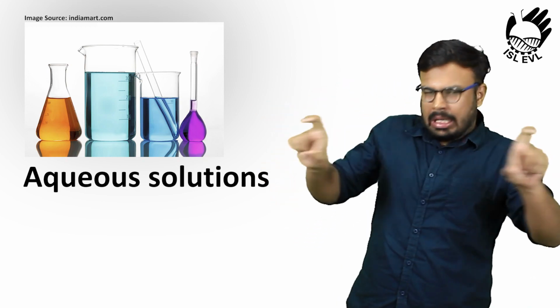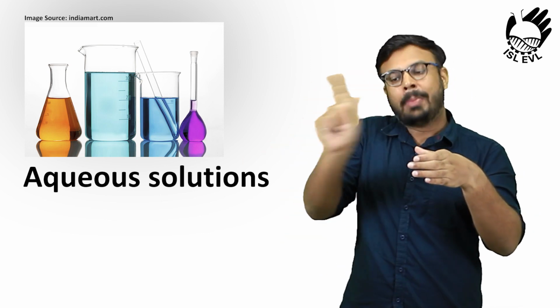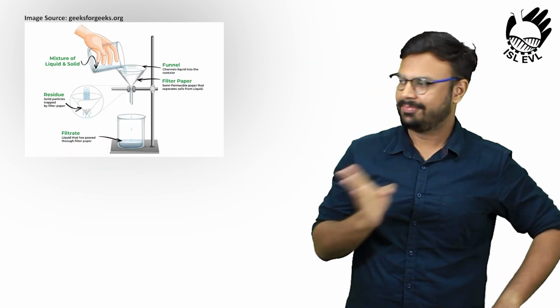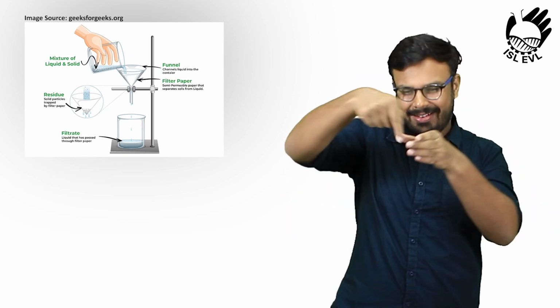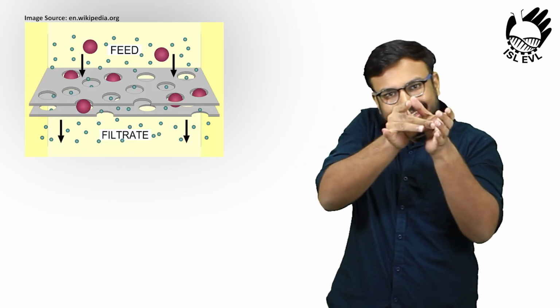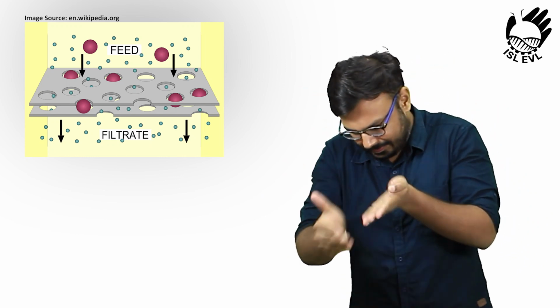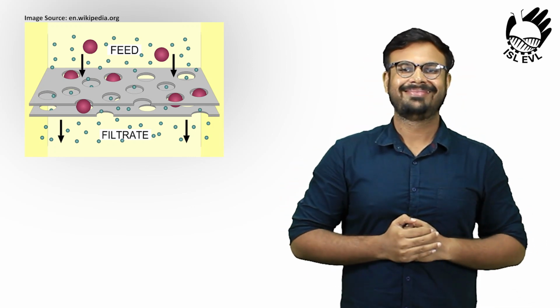Crystallization is also a useful chemical technique to separate or purify a solid in its pure form from a solution. This is done by dissolving the sample in a hot liquid, making a saturated solution. Anything that does not dissolve in the hot liquid can be removed by filtration. And what part of the solution remains can then be used to grow pure crystals which can be collected and dried.